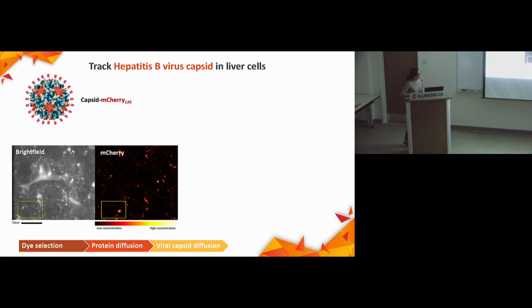And here you see the confocal image from MINFLUX. On the left side, it's a bright field just to see the boundary of the cell. Unlike the previous images we saw, we're expressing the protein in the cell, so we're not able to inject any other dye to visualize the cell, so we use a bright field. And we observe that the cells are pretty crowded, and this is, again, the preliminary image or measurement that we could manage to get with the 3D mirror working.